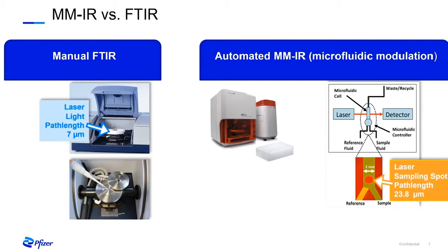alternately measure at 1 Hertz frequency, meaning at every 1 second switch the stream once and measure for a second between the reference and the sample streams. So it can subtract the reference stream signals or the buffer blank signals continuously to produce a drift-free measurement. Why drift-free? Because it continuously refreshes the instrument referencing almost in real time with your sample measurement.